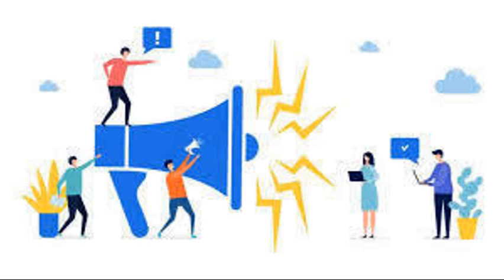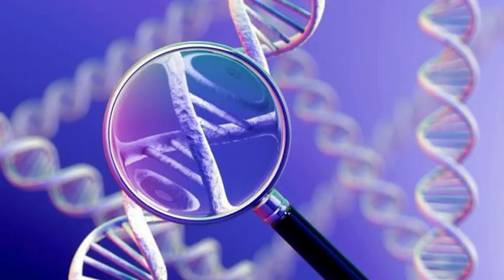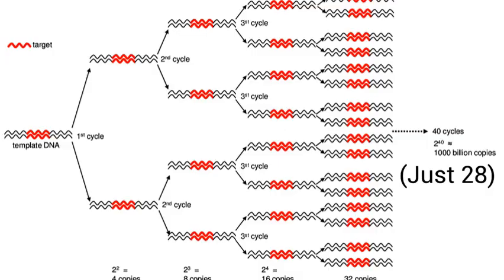Amplification is done by using a technique called PCR. PCR is the process of making billions of copies of the DNA sample, since the crime scene most likely does not have as much quality or quantity. It allows us to detect and identify gene sequences a lot easier by visual techniques. This process consists of heating and cooling the samples in a 28 cycle process.